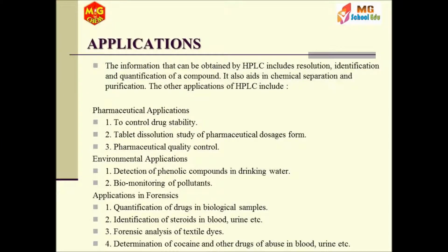Applications. The information that can be obtained by HPLC includes resolution, identification and quantification of a compound. It also aids in chemical separation and purification. The other applications of HPLC include pharmaceutical applications. 1. To control drug stability. 2. Tablet dissolution study of pharmaceutical dosages form. 3. Pharmaceutical quality control.